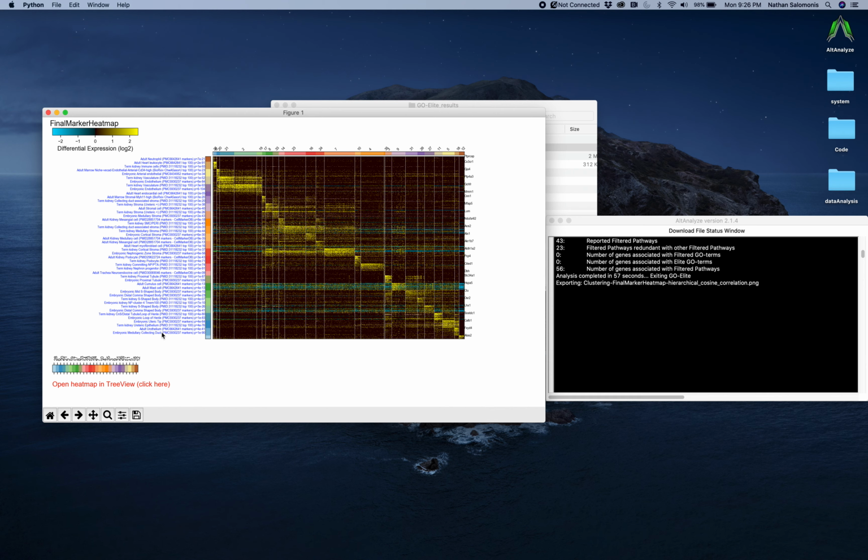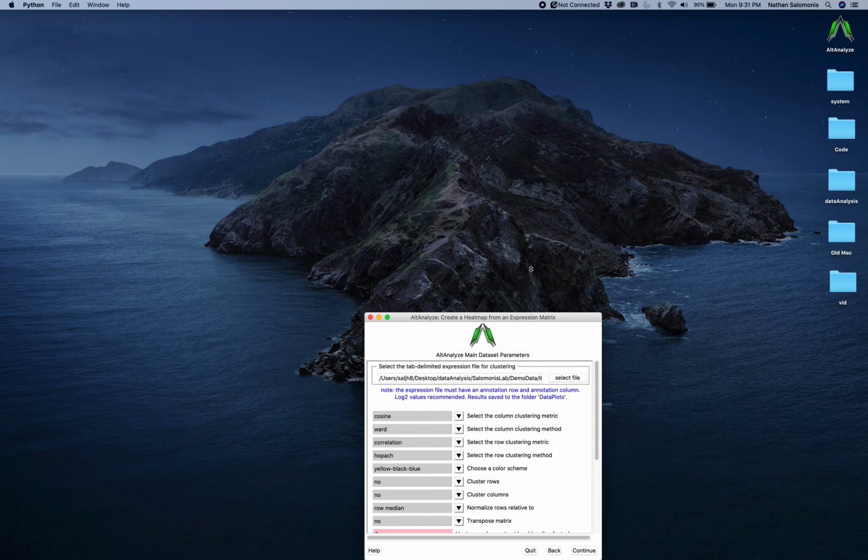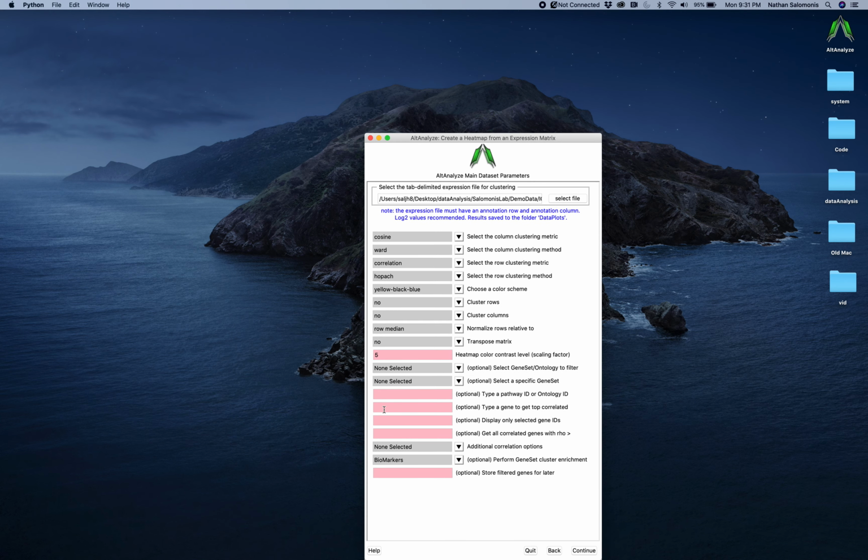And you can see that there are actually multiple terms in some cases, reported based on how much the program can basically fit little labels onto the left side of these heat maps to, again, indicate what the likely cell types are. And you should see some similarity between very similar terms that are associated with the same cluster. In addition to these gene set enrichment analyses that you can directly perform within the clusters, you can also perform some dynamic filtering within these heat maps that gives you an ability to really customize how you want to display and what you want to display.